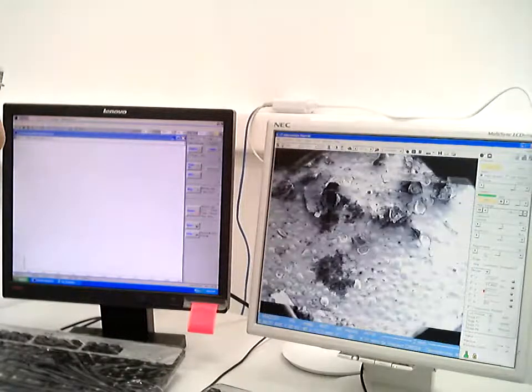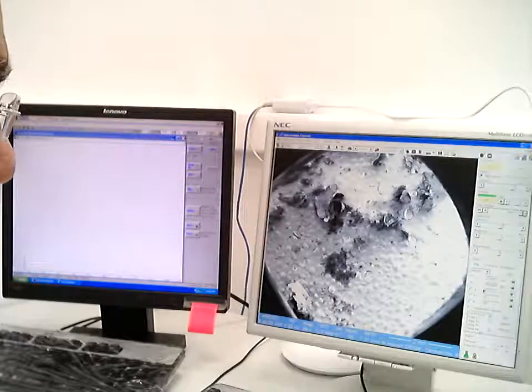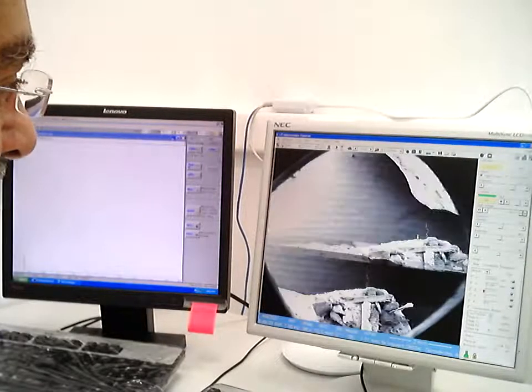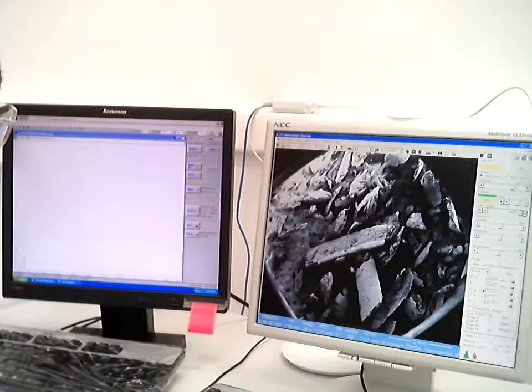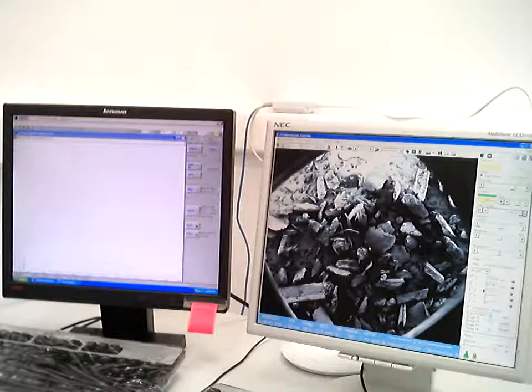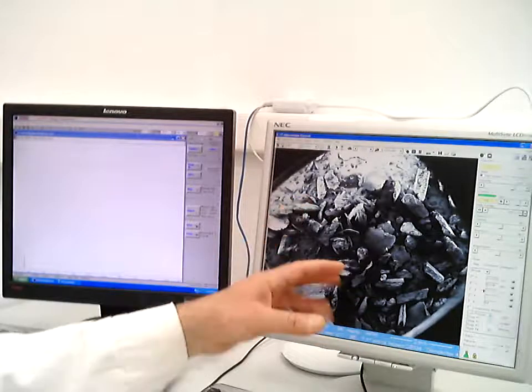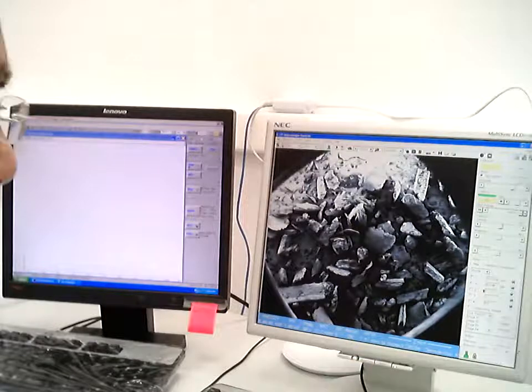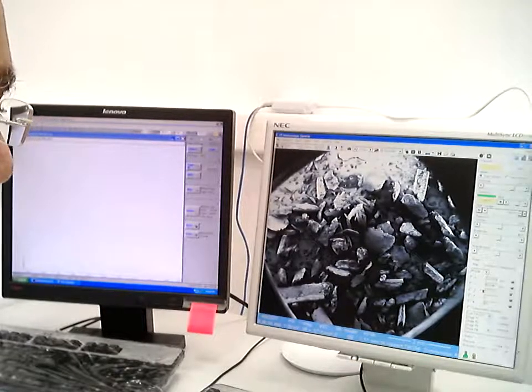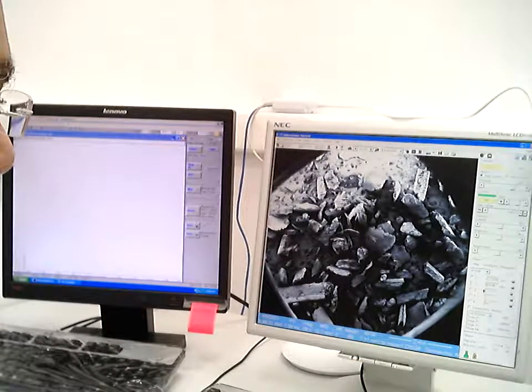Finally, and I'll show you now a fourth one, is some evidence of soil. Now this is particles that could have come from a shoe, or could have come from the fingernails or things like that. Now together with this wood, there's a lot of wood particles here. Let's say this one. These are wood particles.